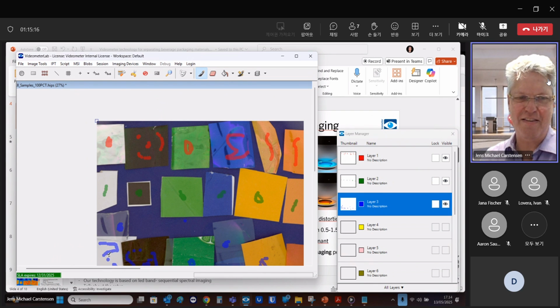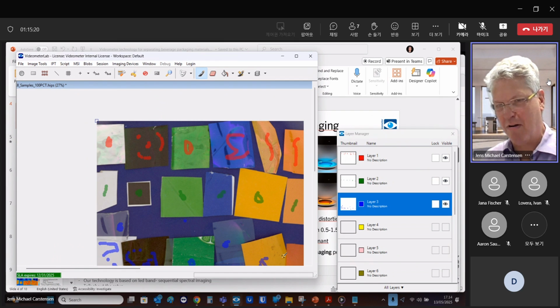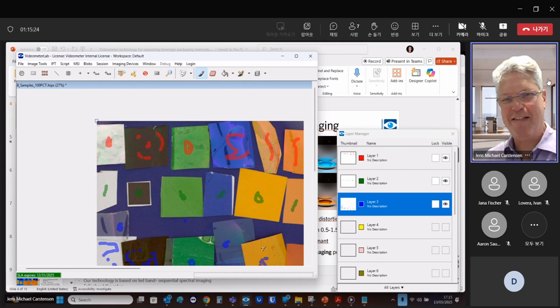And the last row, the third row here, is plastic bottles or pieces of plastic bottle. The interesting thing about this image is that they all have different colors, so they come in similar colors, but only the material behind is the same across each row, but different between rows.